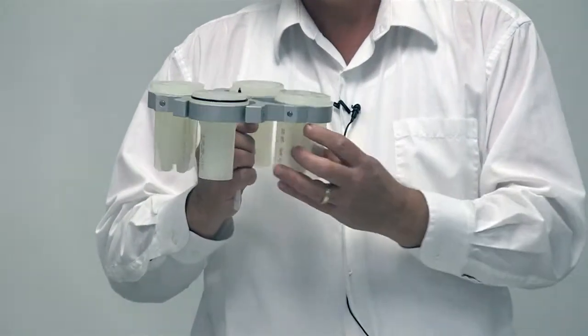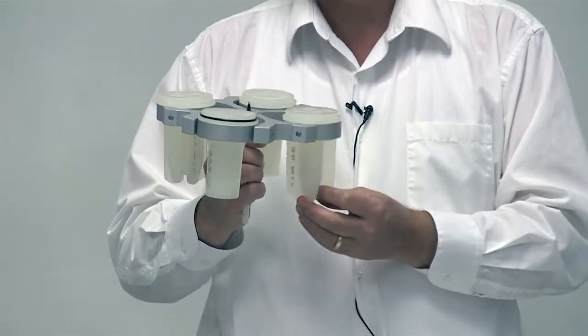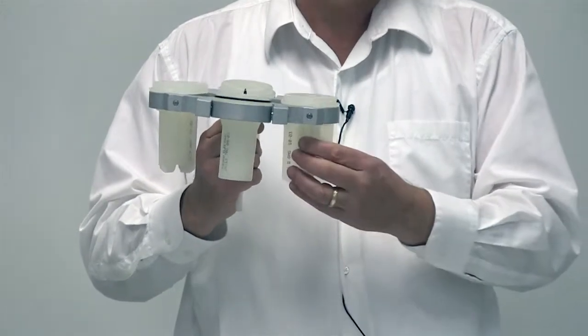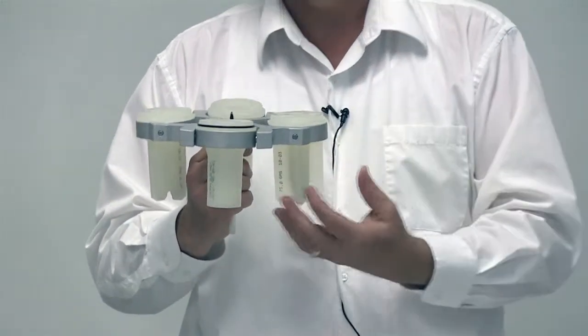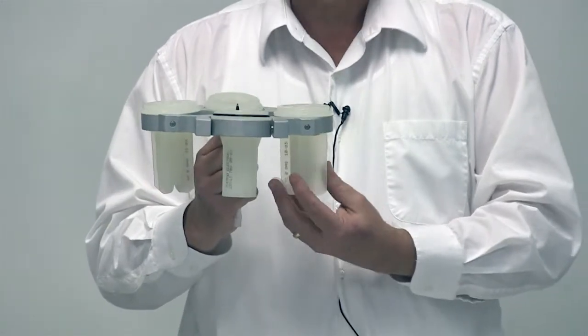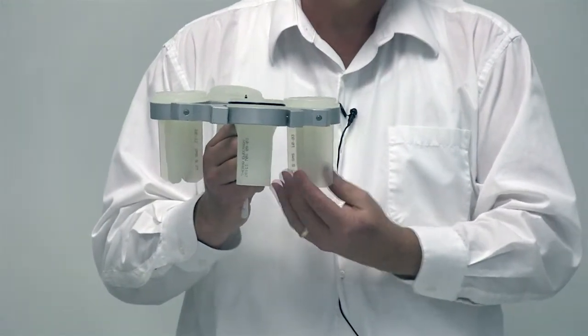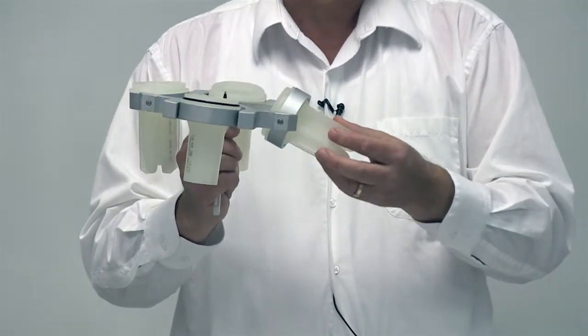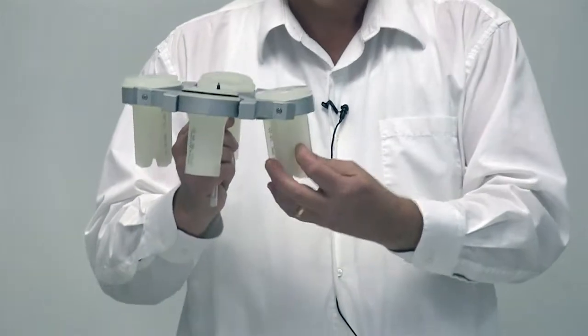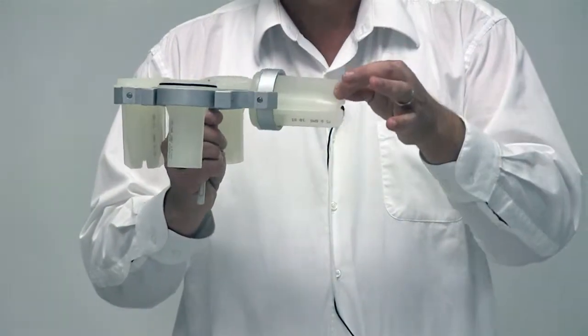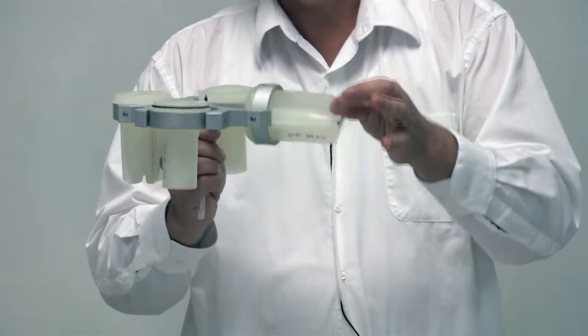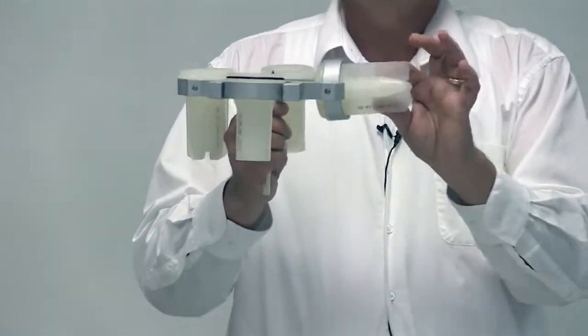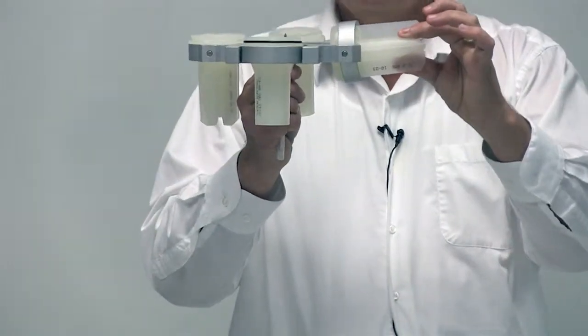Now remember that we're talking about centrifuging suspensions as opposed to solutions. We've talked about solutions where we have a solute dissolved in the solvent. In terms of a suspension, the particles are suspended in the liquid but they're not dissolved in it. The force of gravity applied by the centrifuge on these particles will cause them to proceed toward the bottom of the tube.